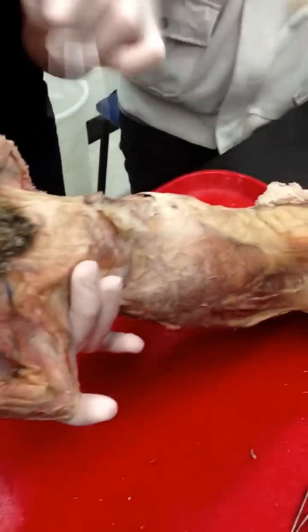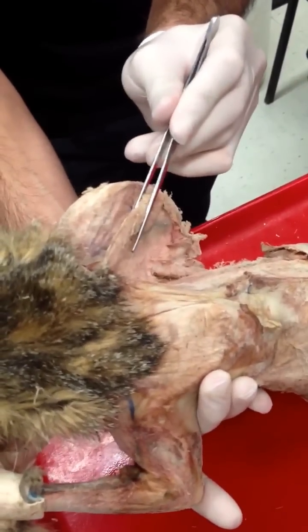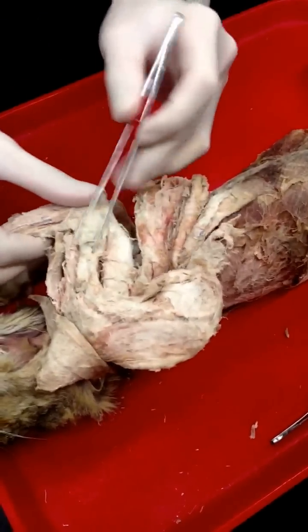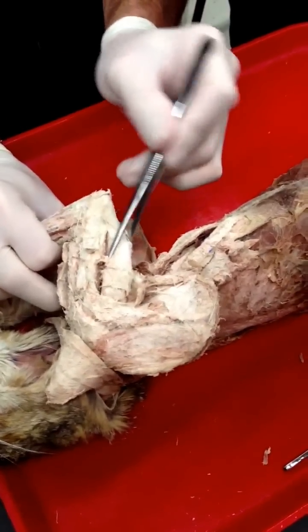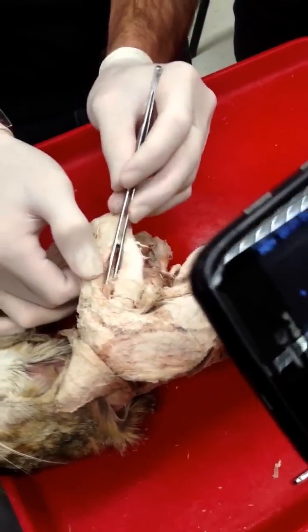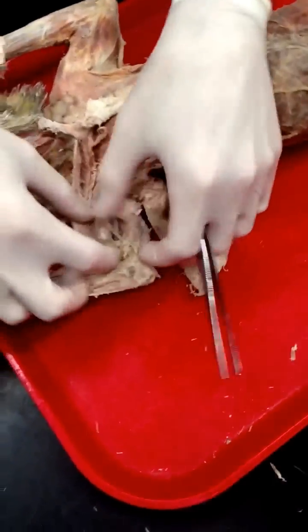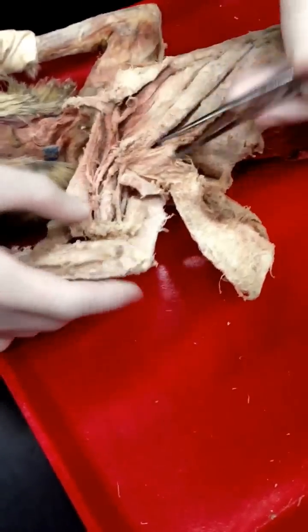Subscapularis, rhomboids, teres major. Lateral head of the triceps, long head of the triceps, medial head of the triceps. Brachialis, biceps brachii. Epitrochlearis.